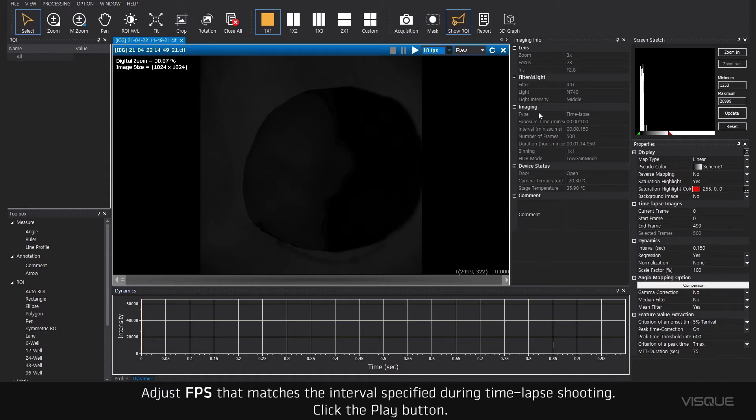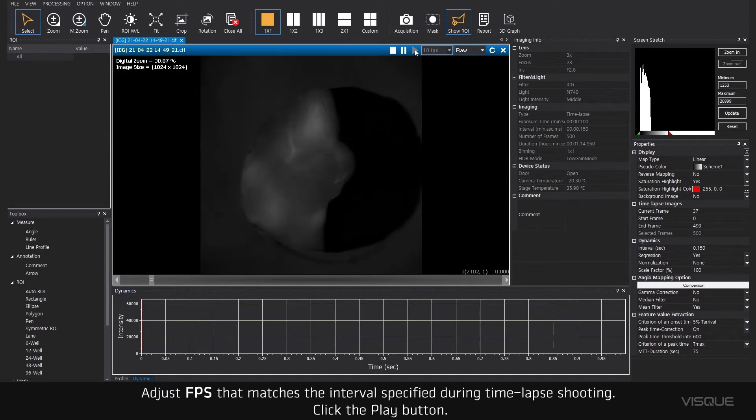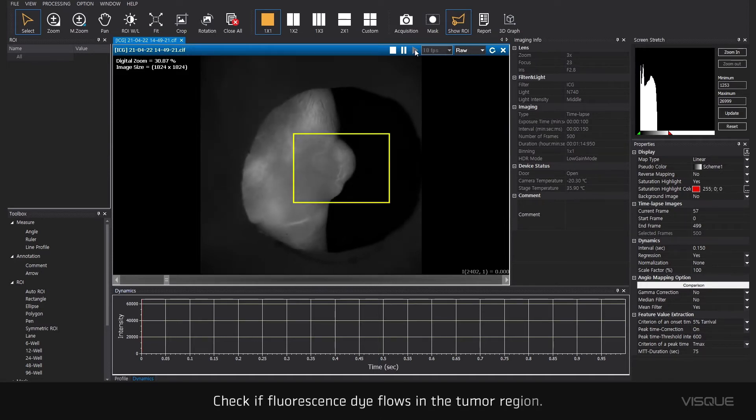Click the Play button. Check if fluorescent dye flows in the tumor region.